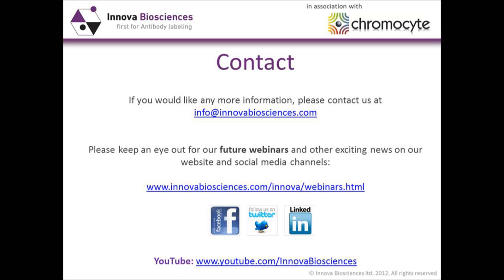In actual fact, what is attracting a lot of interest now is the role of autophagy in a lot of biological processes, and there are now techniques for looking at autophagy using flow cytometry. So I think there are lots of options available for you.